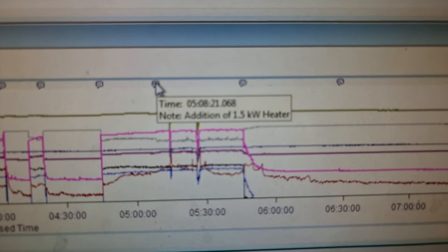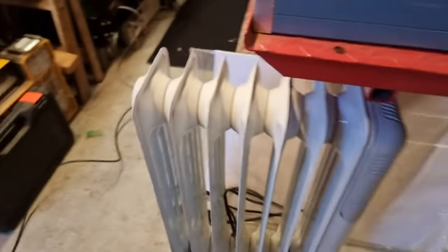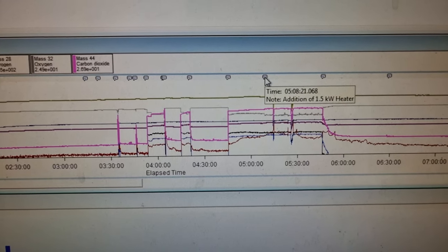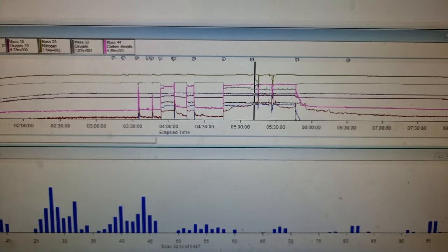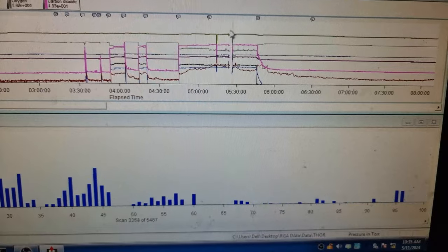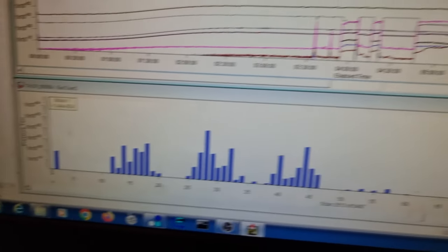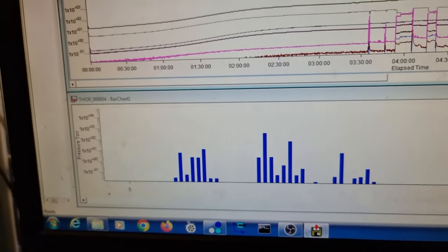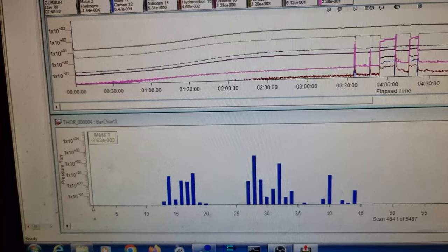Here we added a 1.5 kilowatt heater — a sort of radiator. When the radiator was on, before it there were not so many hydrocarbons, but after the heater is added we've got quite a few hydrocarbons in there. There are a couple of little drops down and we have a question as to why that might be. You still see plenty of hydrocarbons and also hydrogen probably coming from that. Then we turn off and it drifts down to an approximation of the original starting air, with a bit of contamination — but we're close to the original air.